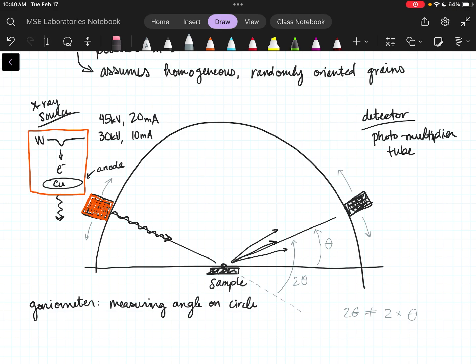Why? Well, I guess my theory is, I don't have exactly sound backing on this, so I apologize if I'm wrong. My assumption is that we first noticed this on specific materials where theta and 2 theta were equal to each other in the way you'd expect. That theta and half of 2 theta were the same as each other.